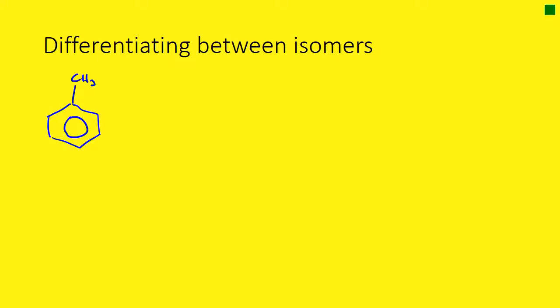So in red, I'm going to draw the number of chemically equivalent environments. And so these numbers are not like the normal carbon numbering when we're naming a molecule. So we've got this carbon here would be in environment number 1, and that would be different to this carbon here, which we can say is in environment number 2. These 2 carbons that I'm just circling now, they are equivalent because of the symmetry of the molecule, but they would be different to the other environments, so we can give them both number 3.